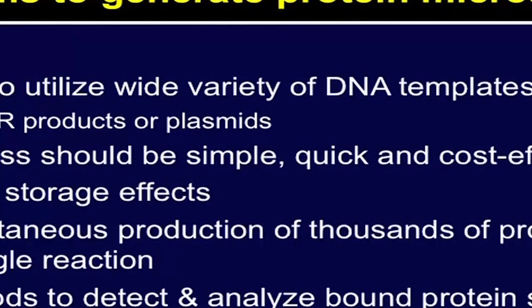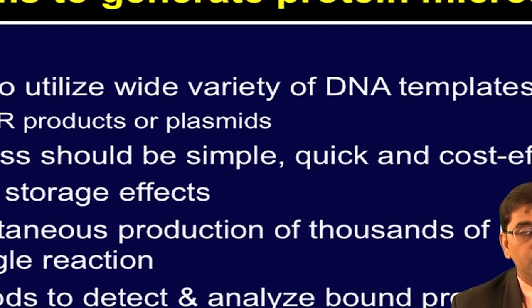We will first talk about the requirements of cell-free expression system. Cell-free expression system should meet certain requirements, and these criteria are that they should be able to utilize a wide variety of DNA templates. This brings out a versatile platform. The system should be simple, quick, as well as cost effective. When we are talking about protein microarrays, the applications are essentially for clinical studies, where one needs to study several patient samples. Thus, an expensive technology becomes a hurdle for its widespread use.